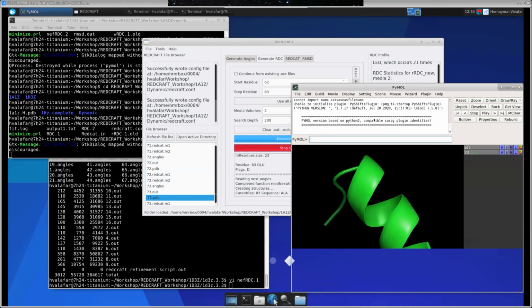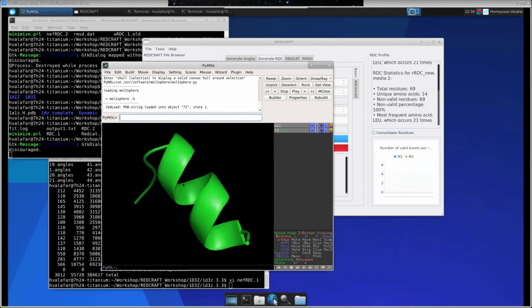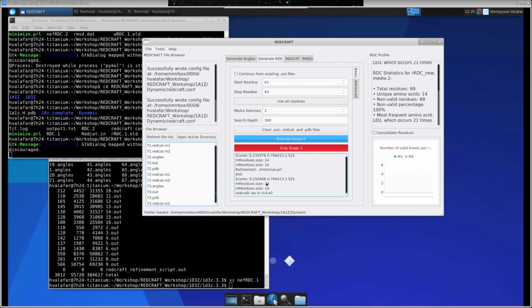So 73.pdb, this is the structure that you would get, so this portion is undergoing rigid body dynamics with respect to the first domain. Okay, it's rigid because it contains this very nicely decipherable structure. Correct. Now the question becomes, is it the magnitude of dynamics? And again, if you look at some of our work, based on order tensor discrepancies between two domains that are undergoing dynamics, we can reconstruct to atomic resolution, to within 1 or 2 angstrom, the 2, 3, or 4 states that consist of the jump states.